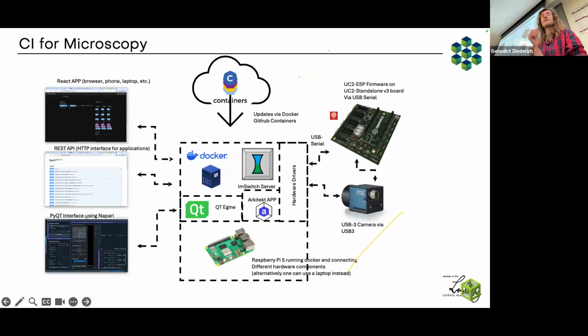For this, together with Ethan, we now have a full operating system, which a month ago I would never have believed is possible, where the control mechanism, the display mechanism, everything is packaged in something called a Docker image. For me, it's like a huge zip file with all the ingredients that we need. You flash that on the SD card, you start it, and it's just working. This is a bit of magic.